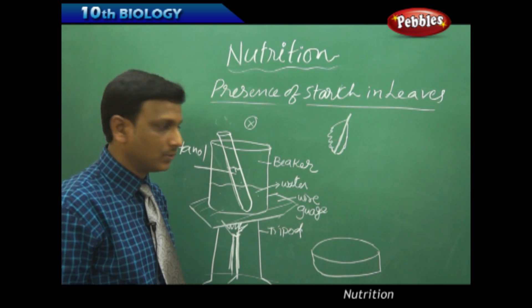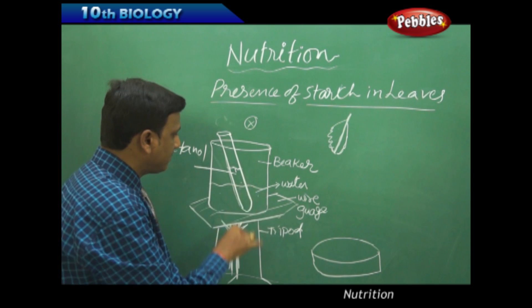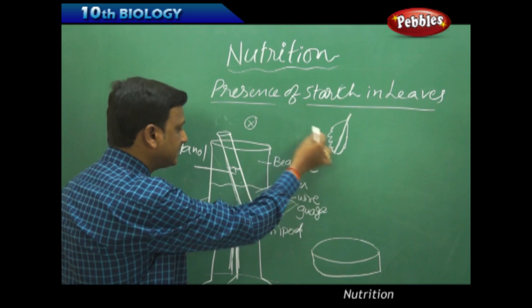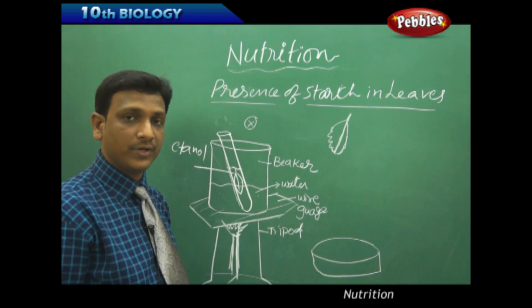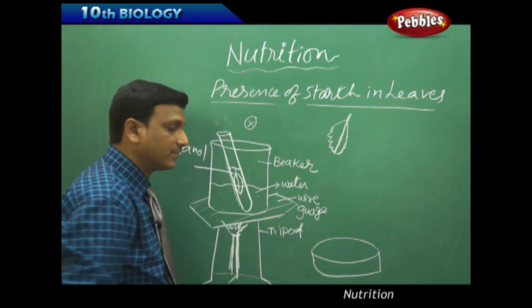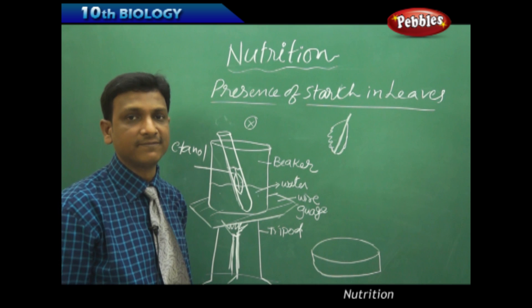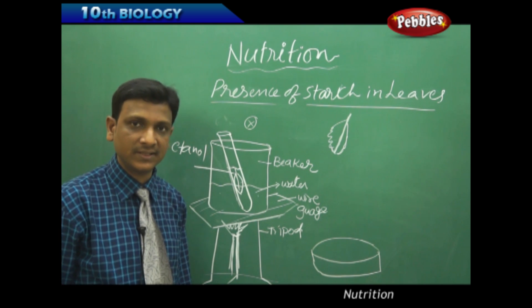So what can we do? We have taken a water bath, that is a beaker with water. In the beaker, we carefully place a test tube with ethanol and we are going to place this leaf in this beaker. We are going to boil this content for some time. Depends upon the size of the leaf, type of the leaf. Some leaves take 10 minutes, some take 5 minutes.